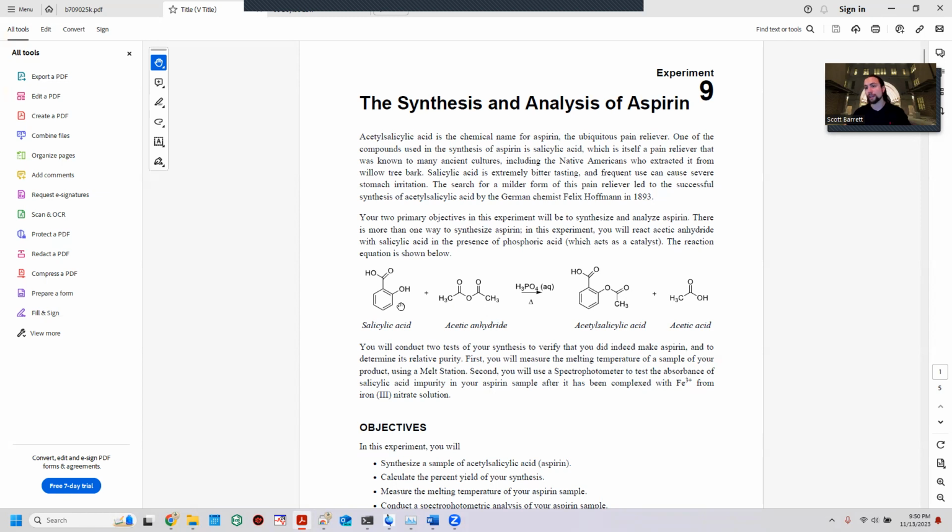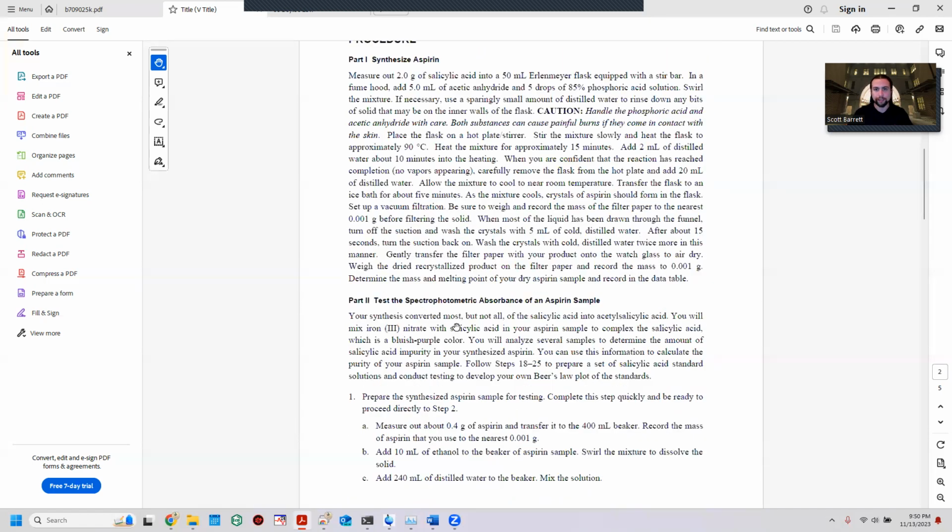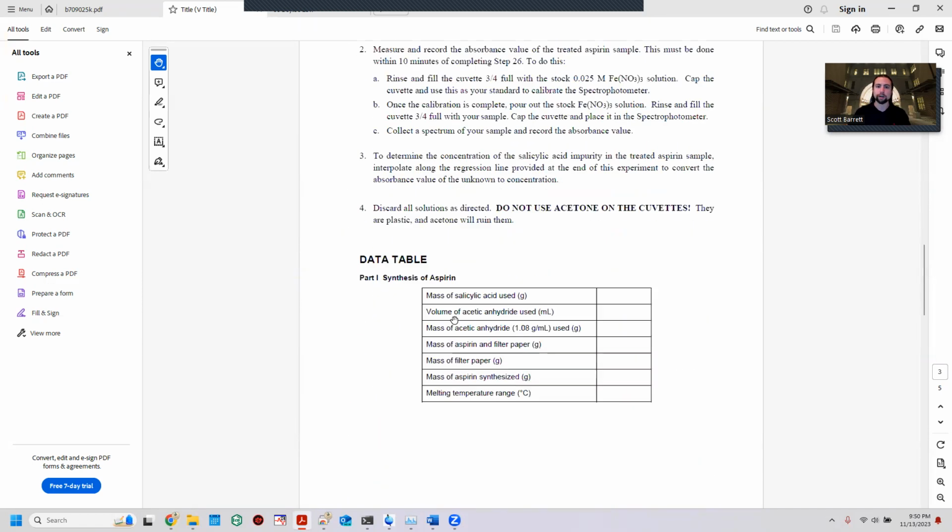Then if you ran an NMR of this, the difference would be that you would not see this hydroxyl group. You would still see a carboxylic acid because it's in both the starting material and the product. But the main thing is that you would end up having this carbonyl here, and you'd have some protons relative to that, whereas you wouldn't have that on your starting material. So those are the main things you would notice as differences if you were to take NMR, IR.